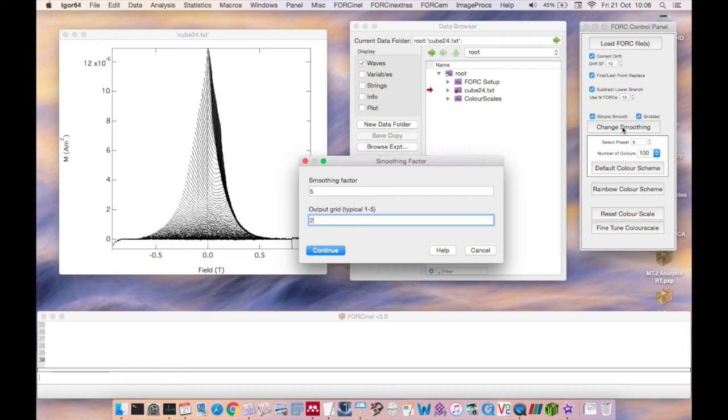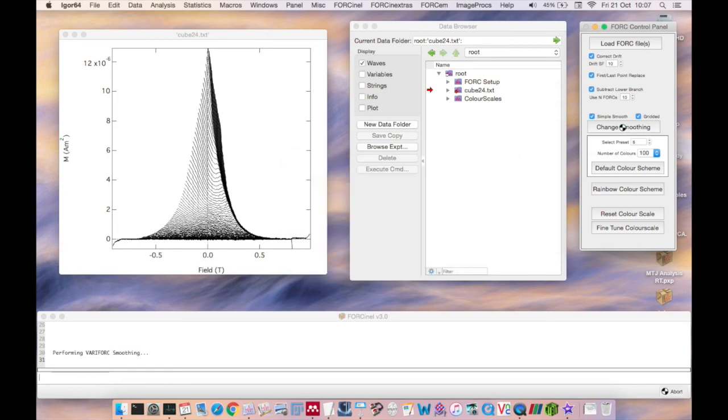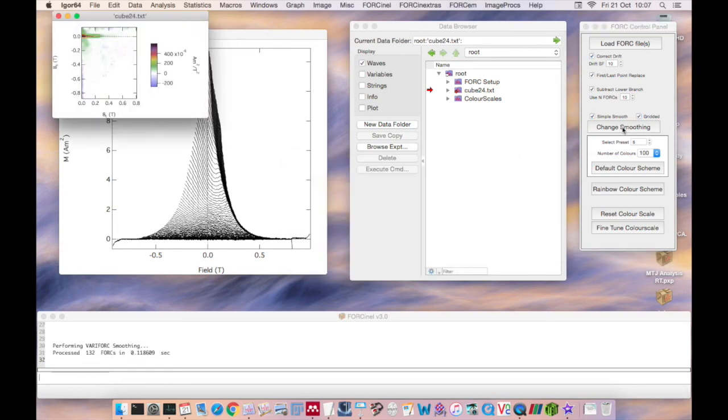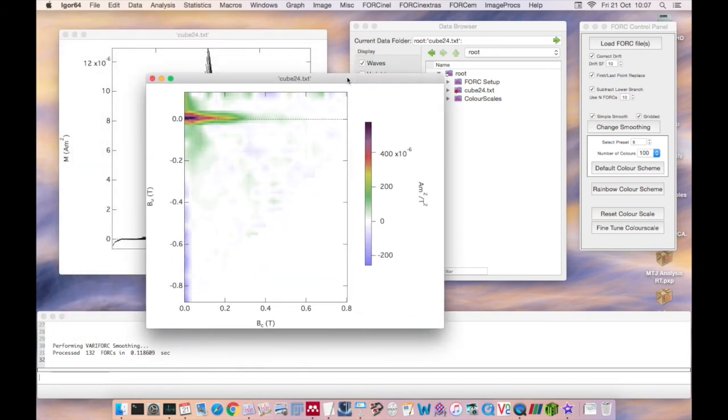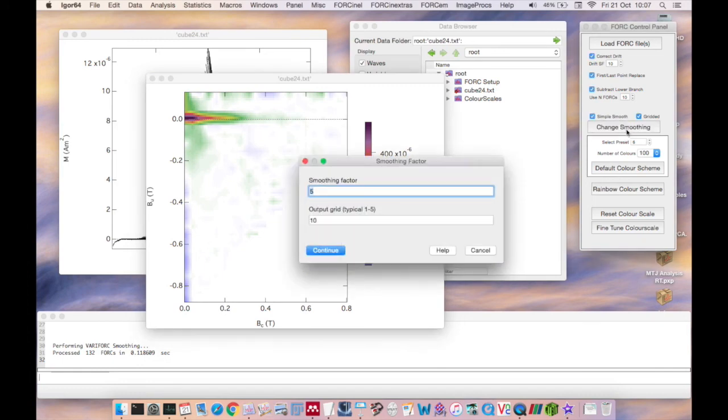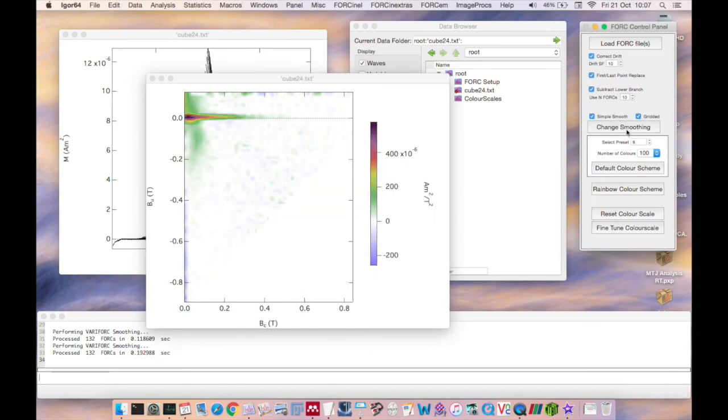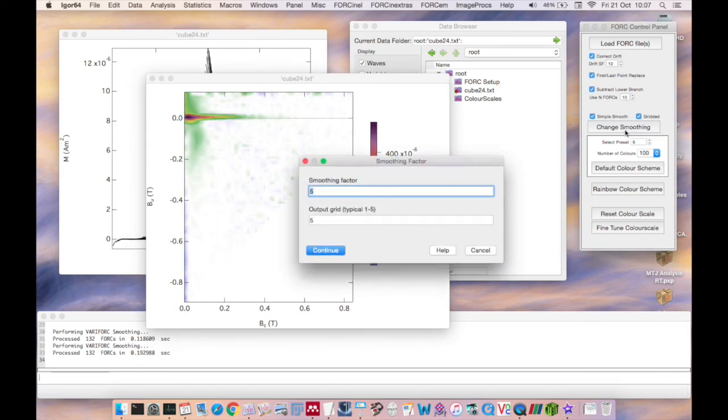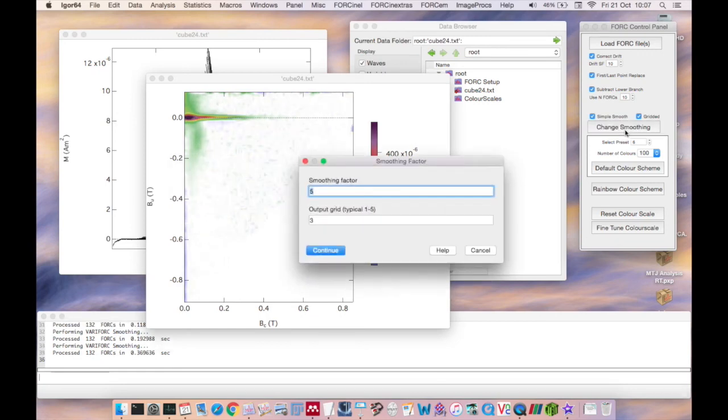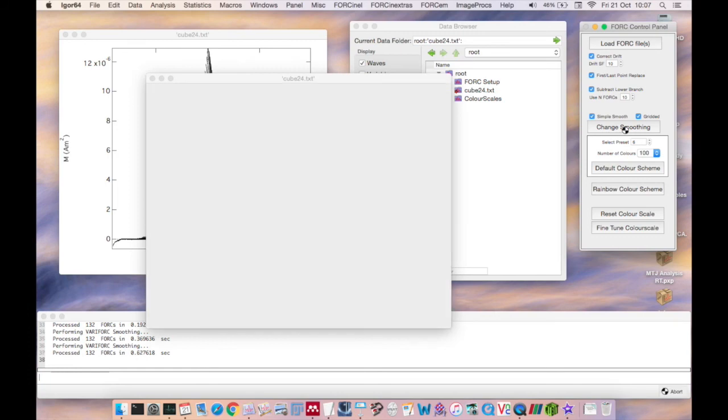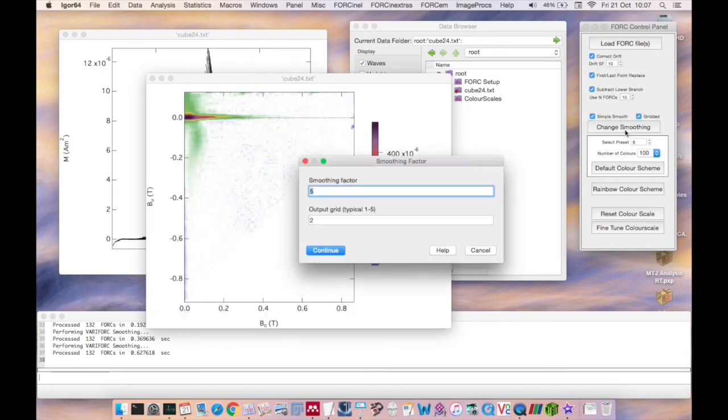Essentially the higher the output factor the lower the resolution of the output and the quicker the fork diagram will be to calculate. And this is really important for large datasets where you would typically use a factor of 5 or 10 initially while you explore the optimum smoothing factors and then lower that factor down eventually to 1 to obtain your final publication ready fork diagram.